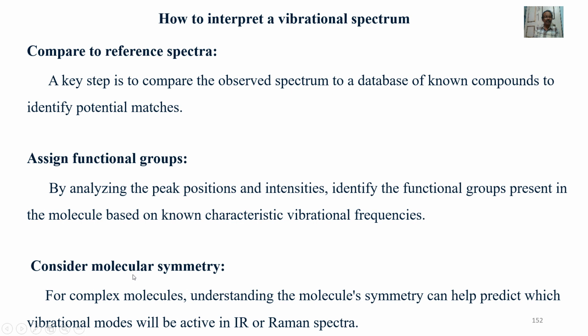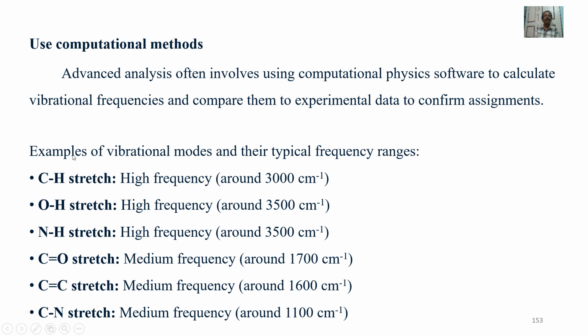Consider molecular symmetry: for complex molecules, understanding the molecular symmetry can help predict which vibrational modes will be active in IR or Raman spectra. Use computational methods: advanced analysis often involves using computational physics software to calculate the vibrational frequencies and compare them to experimental data to confirm assignments.